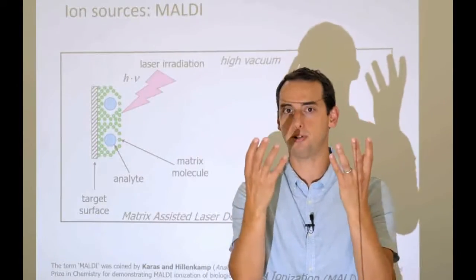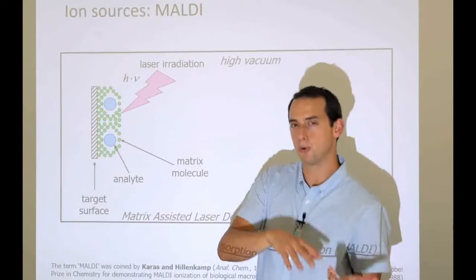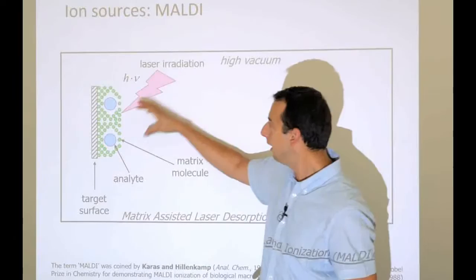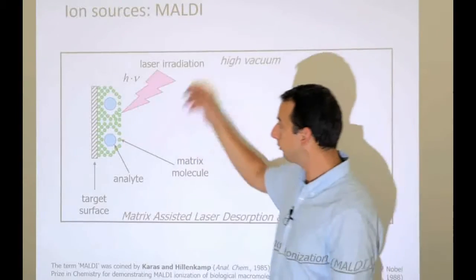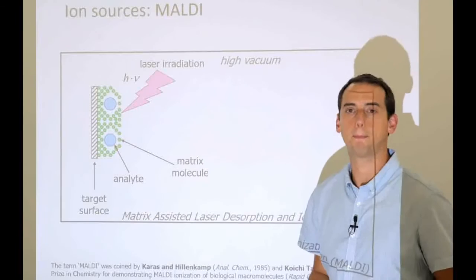That's desorption. It's a fancy term for blowing off the plate. Instead of absorption, you have desorption. So it's going to blow up into the vacuum, and that is where we get the gas phase formation. This is a bit like Star Wars. You're literally shooting lasers at a target, and the target blows up.